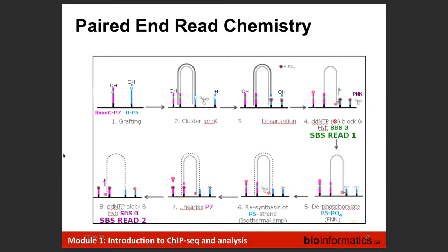Right. So this is a fairly specific case. Now we're talking about mixing two strains of mice together to get variants that we can use to then predict paternal and maternal allele. And there you're going to see a little bit of advantage in the paired end sequencing because you're going to get perhaps some of those variants that would throw the aligner off, depending on how you set your thresholds for doing the alignment, as we'll talk about. So the seed length, right? Because you're going to be able to rescue some of those.